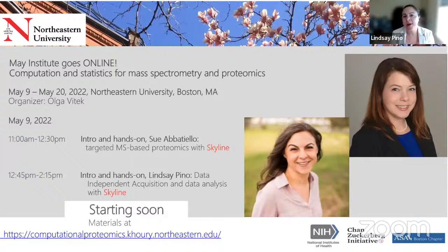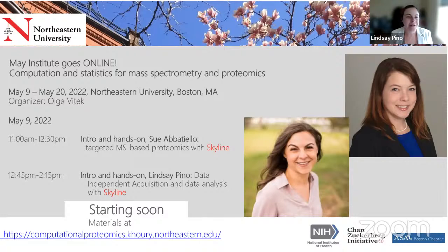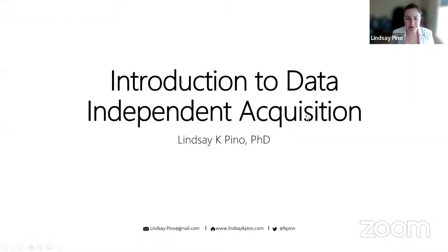In the hands-on section, we're going to do a deeper dive into looking at data and curating data in Skyline. I will try my best to keep up with all of the chat and Q&A, but Sue, Brendan, anyone, feel free to interrupt me if there are a lot of questions in the chat.